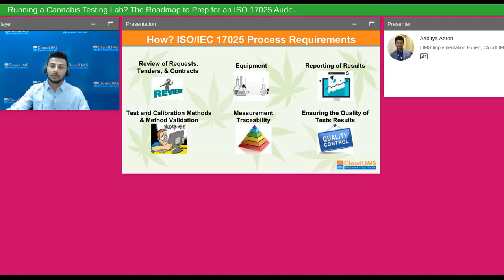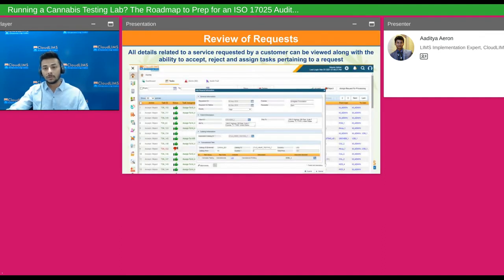And finally, you would like to ensure the quality of your test results at all times, because that is what matters eventually. And all the steps that we've discussed so far are only for our aim to generate quality test results.